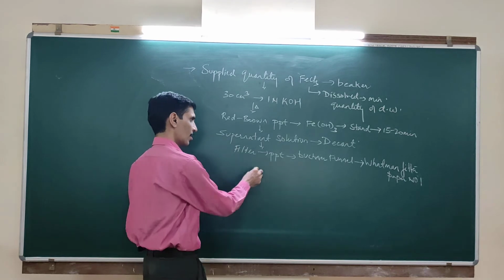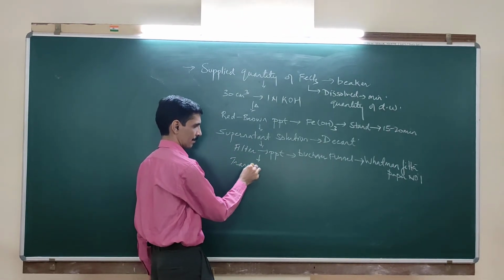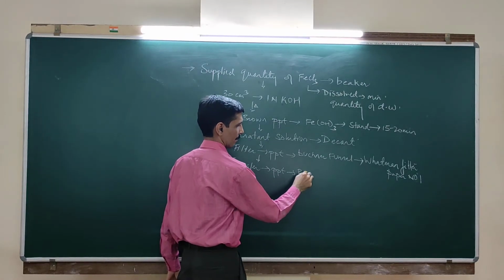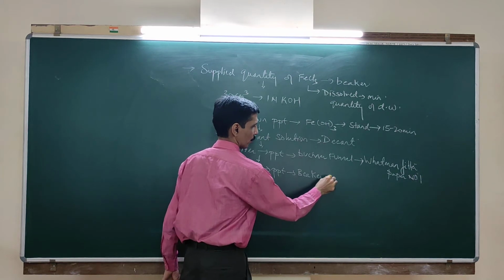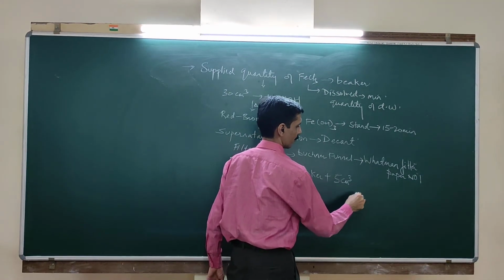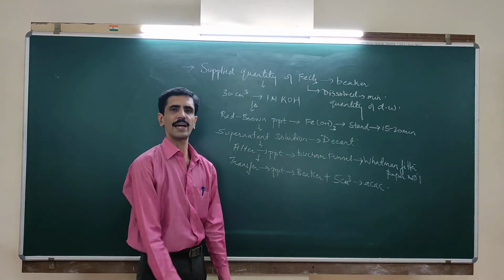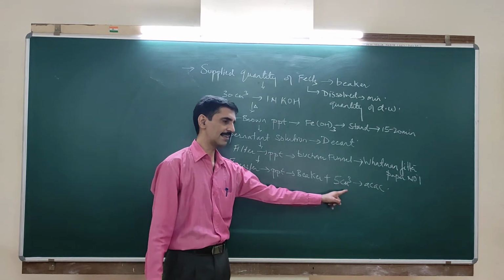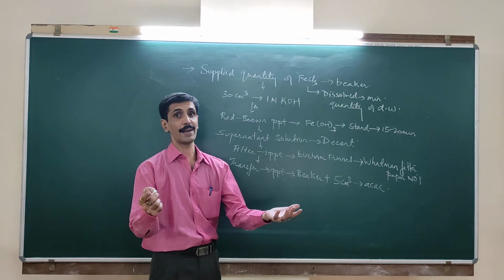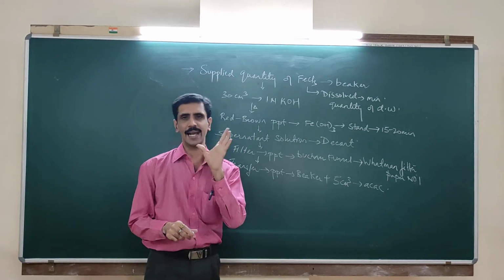Now what you do is transfer the PPT in a beaker and add to it around 5 cm³ of acetylacetone. Okay, we are going to add what? Around 5 cm³ of acetylacetone, which is going to behave as what in this particular complex? Yes, it's a ligand.